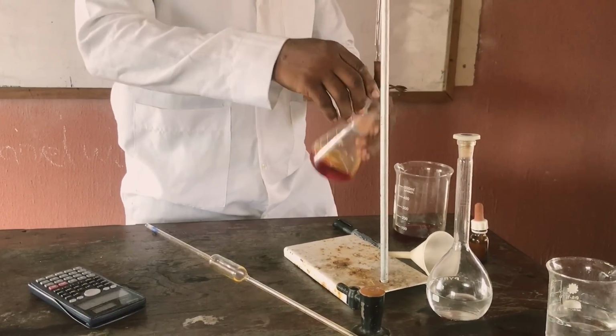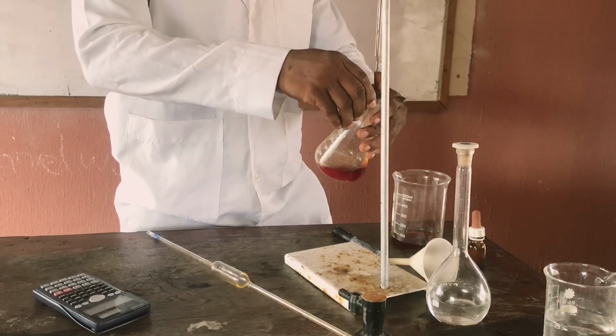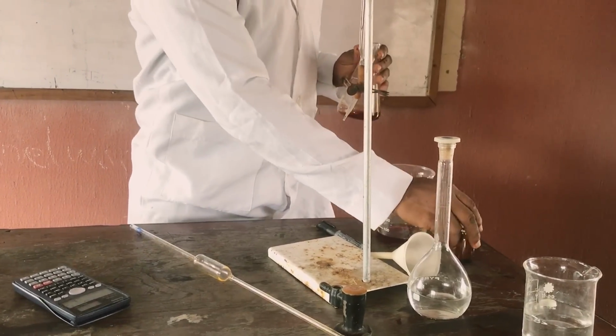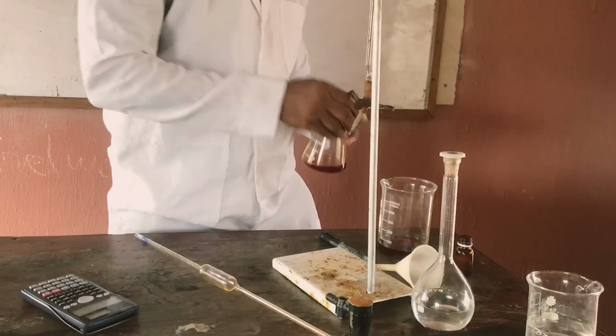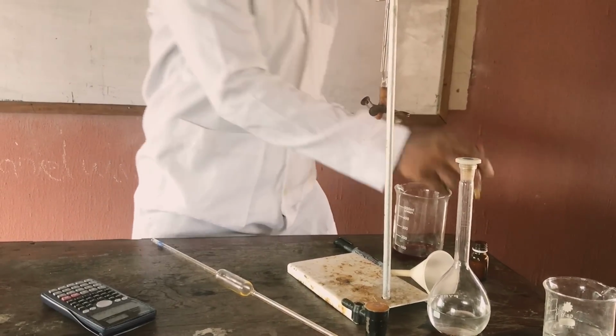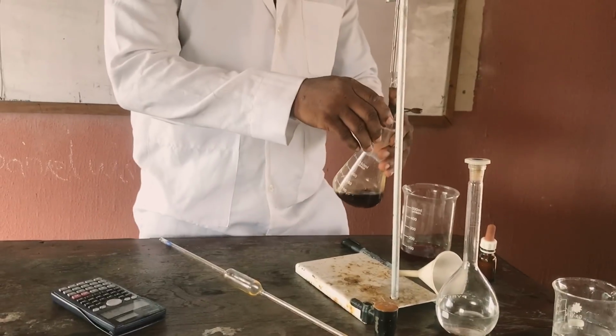Okay, let me add a bit so that the yellow will be obvious. Okay, so let me have 2 drops again. 1, 2. So let's go.